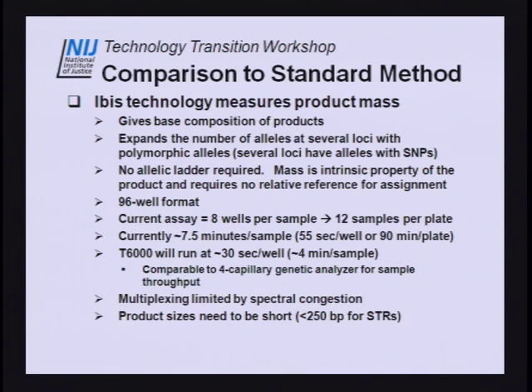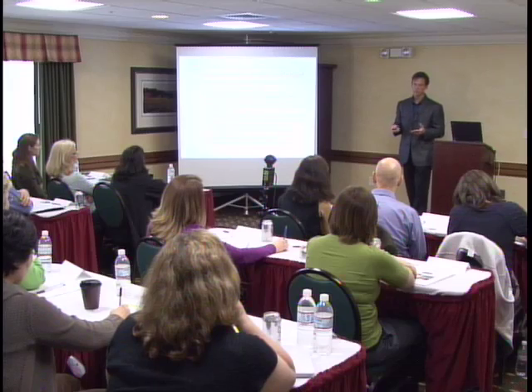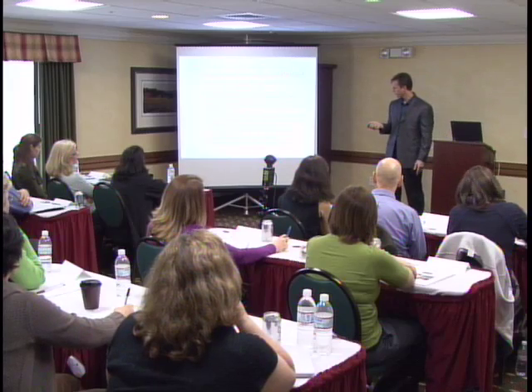We know the allele structure, we know the repeat. We can say we have something that's 18 repeats long, and it's a C to T SNP away from what we'd expect from the reference, even at a pretty big size.